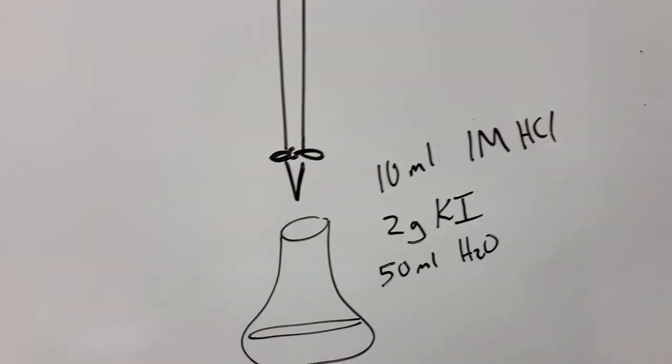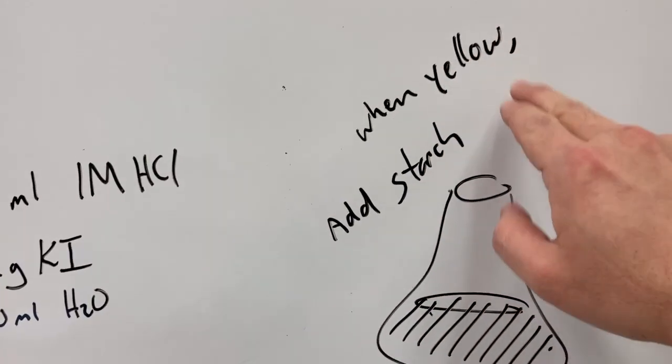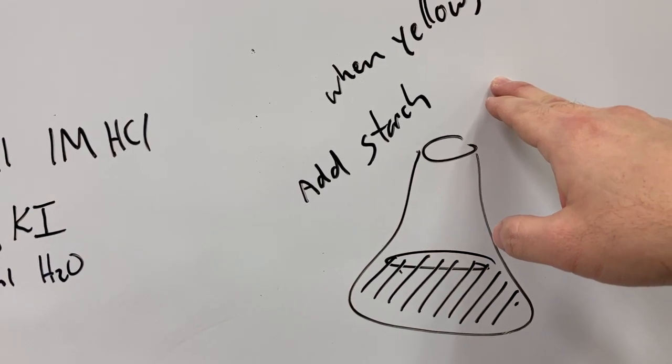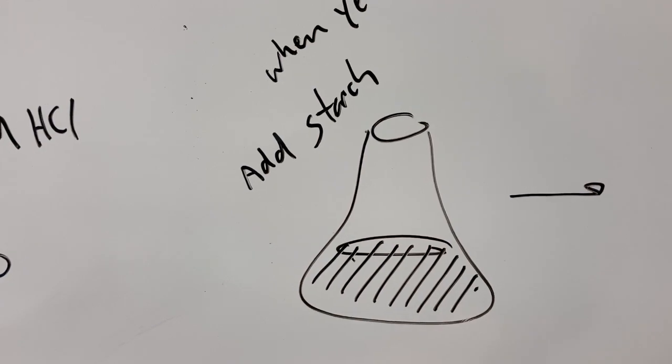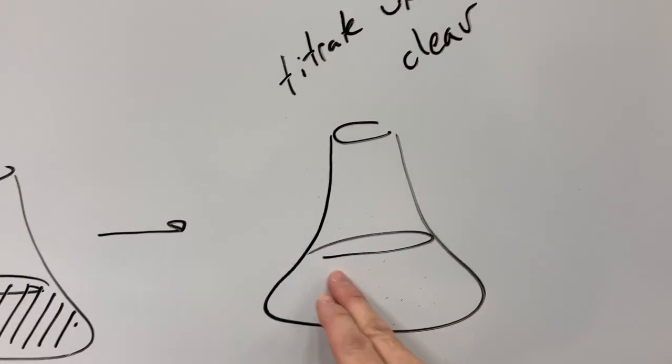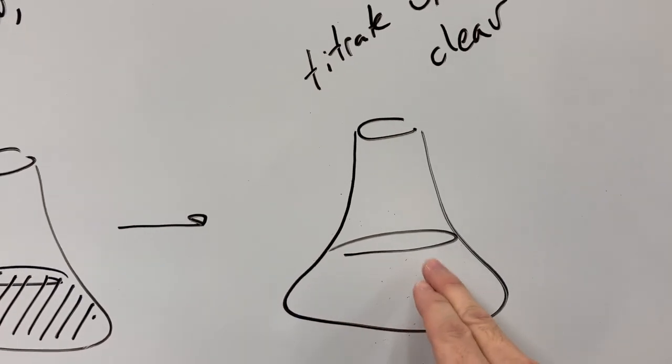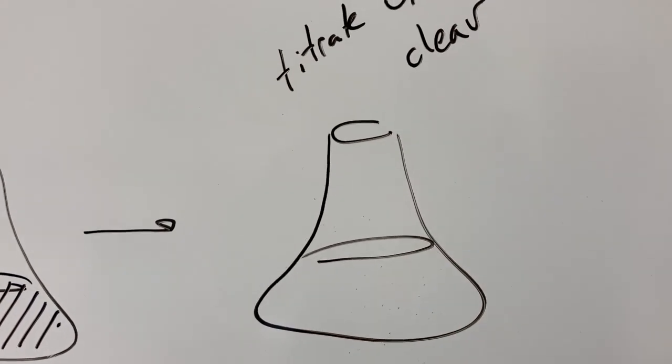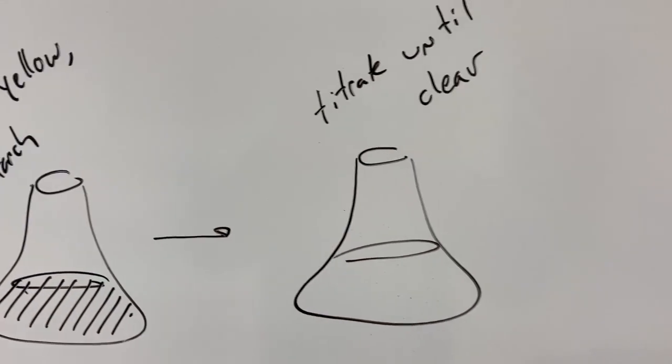So upon titrating our solution will turn eventually kind of like a school bus yellow. At that point we're going to add the starch solution. The starch in the presence of the iodine will immediately turn near black or really dark blue, and then we're going to continue to titrate until that blue color disappears. Once that blue color disappears, that indicates the lack of production of iodine and we know that all the iodate has been used up, and then we stop and we take our volume measurement.